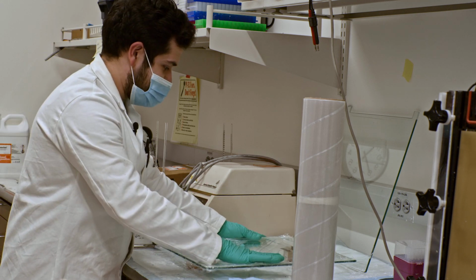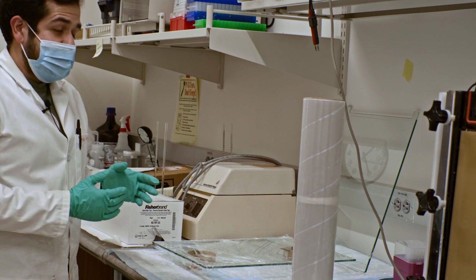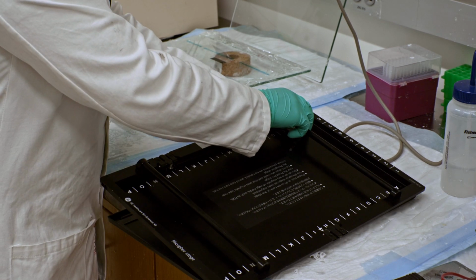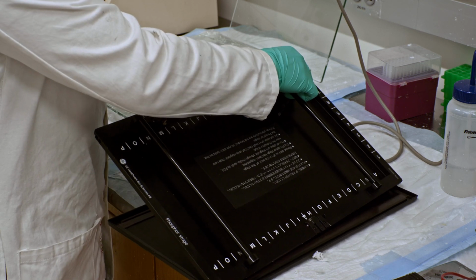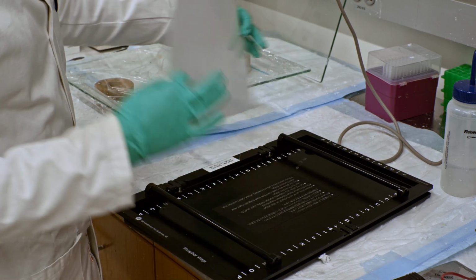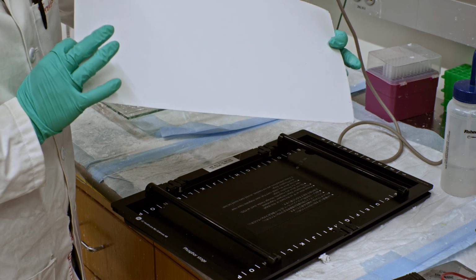Also, the other important thing to know is that the wrinkles on the parafilm don't matter. They won't affect the actual image that comes out. So now we're going to apply the phosphor imaging film. This film is actually found in this cassette that you can find by the Typhoon instrument, which is shared between us and the Harkai lab and the rest of the second floor. This is the film. The actual part that captures the radioactive phosphorus is this white side, but that's the side that we'll actually put down.